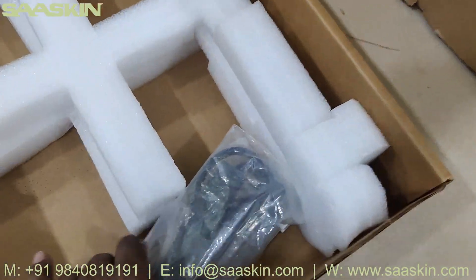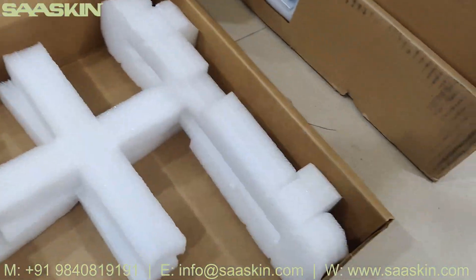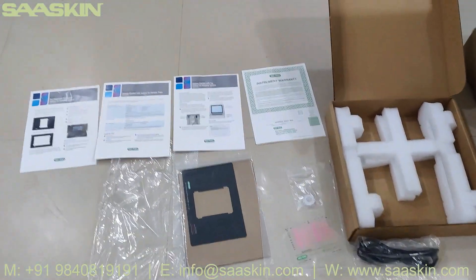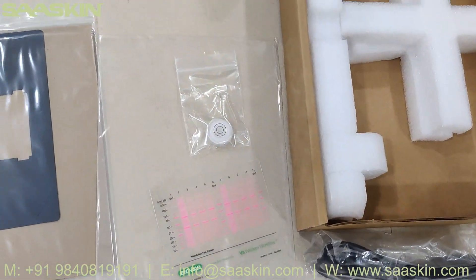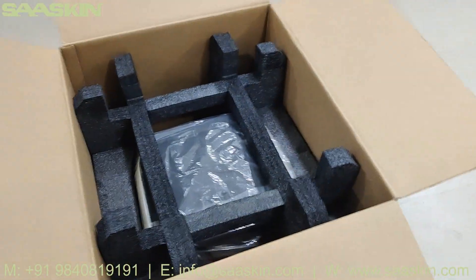You also get a power cord cable. So to summarize the cotton box: it has the different quick guides, the warranty, a plate, the power cord, and the stickers. There is one more small pack as well.